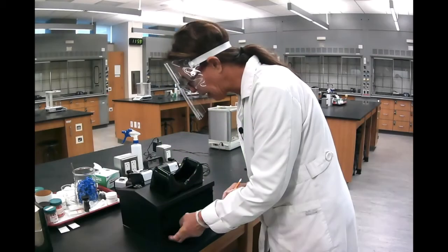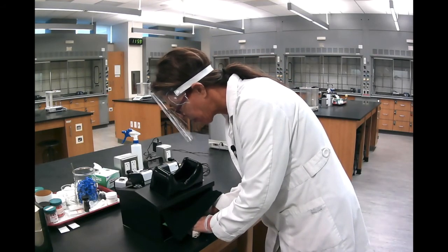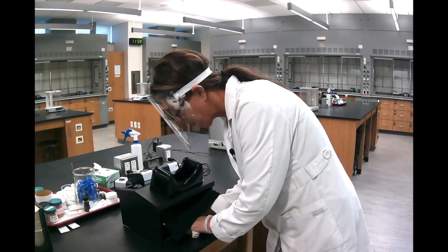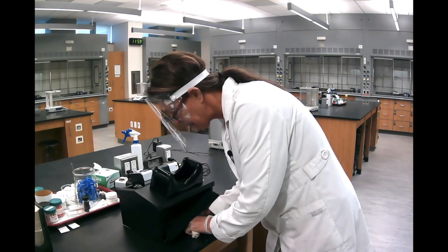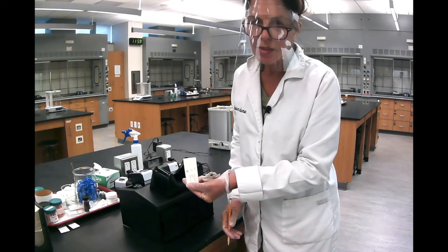The TLC would look like all the spots would be fluorescent, and all you have to do is just make a quick little line around each of these spots. So you go in this dark chamber, and you circle your spots, for both the unknown and knowns. And then once you have all your spots circled, you end up with something like this.